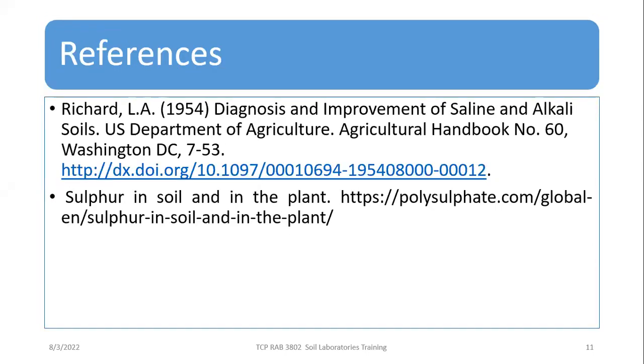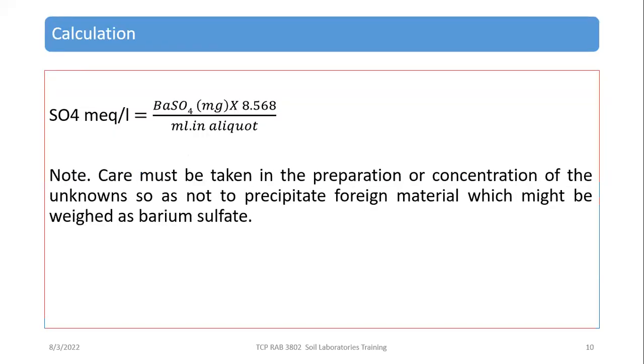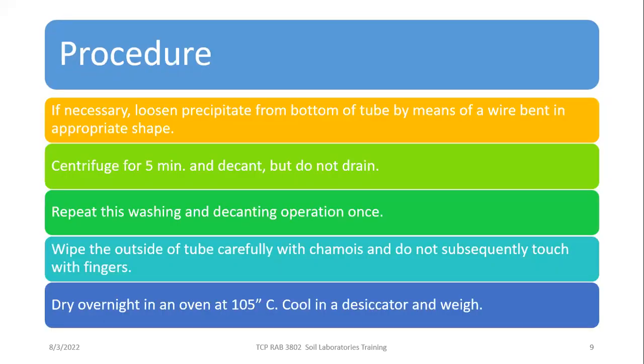And this is the reference for that. And for sulfur in soil, the second reference can be used for further reading. This is the sulfate.